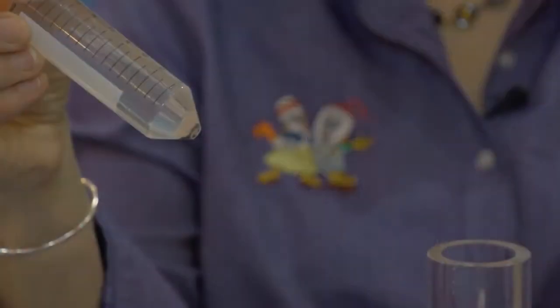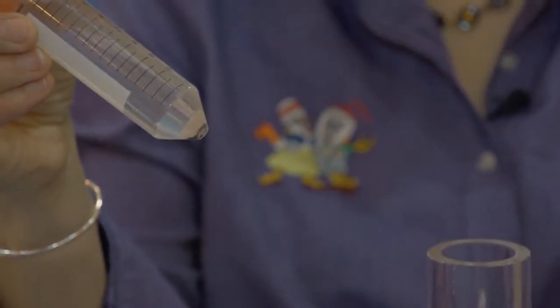Because they're so small, they can be difficult to see on camera. So for purposes of our demonstration today, we're going to be using some magnetic filings, which are quite a bit larger in size. The Bellart SP Scienceware line of magnetic separation racks includes five different configurations.